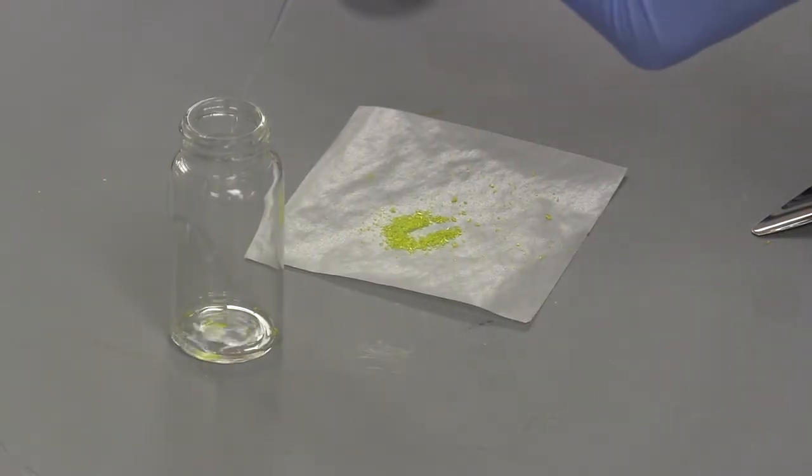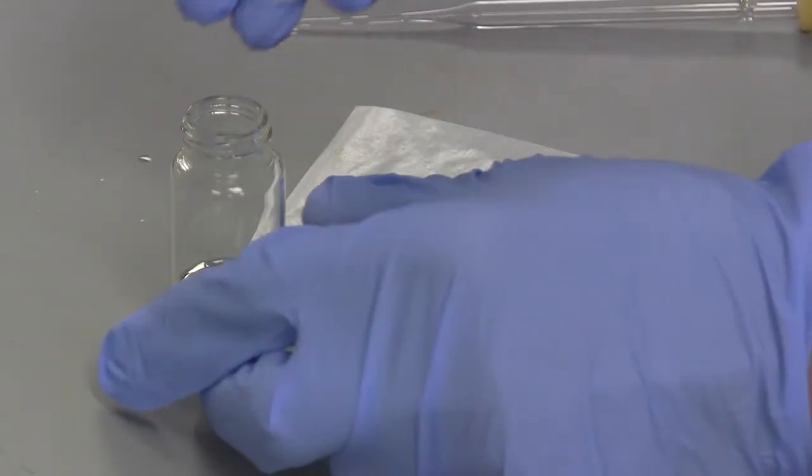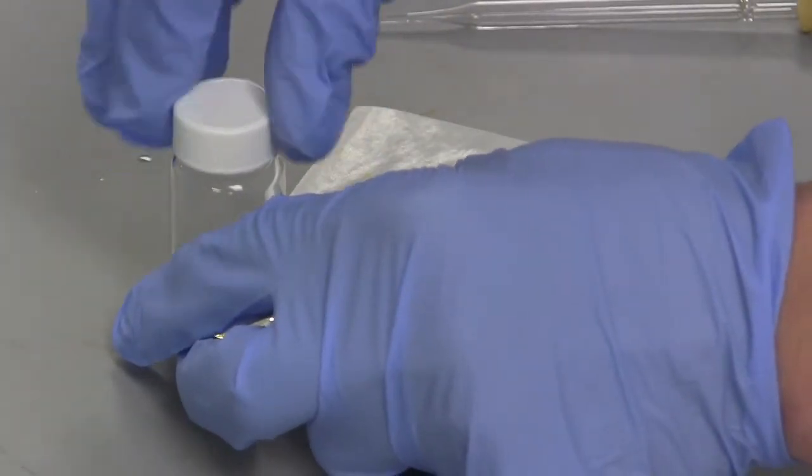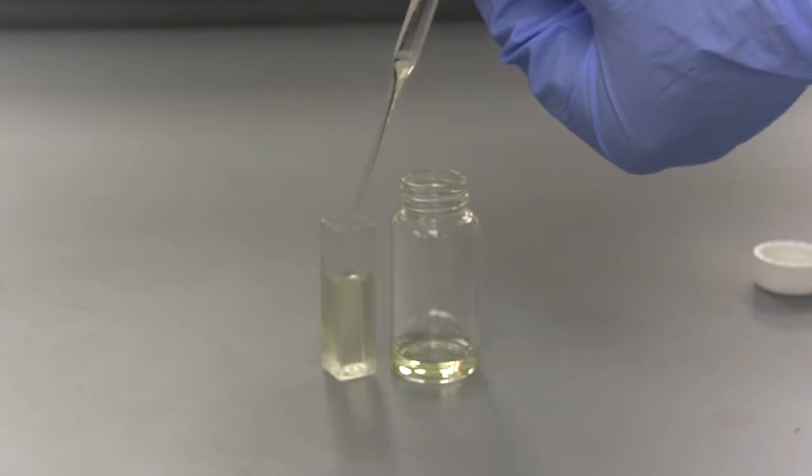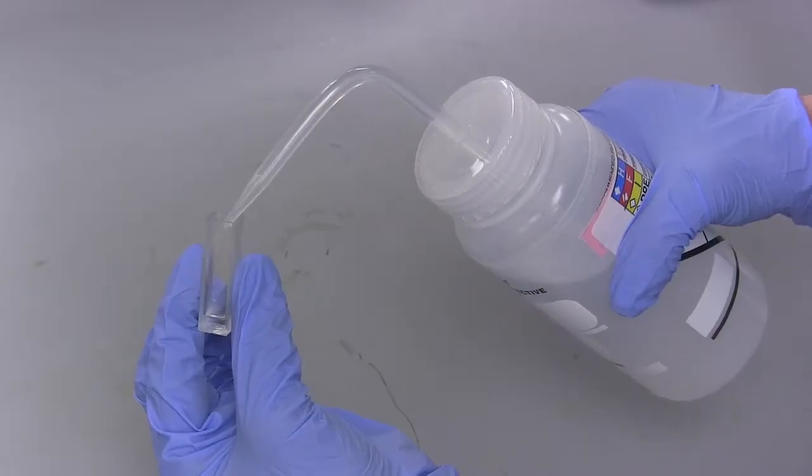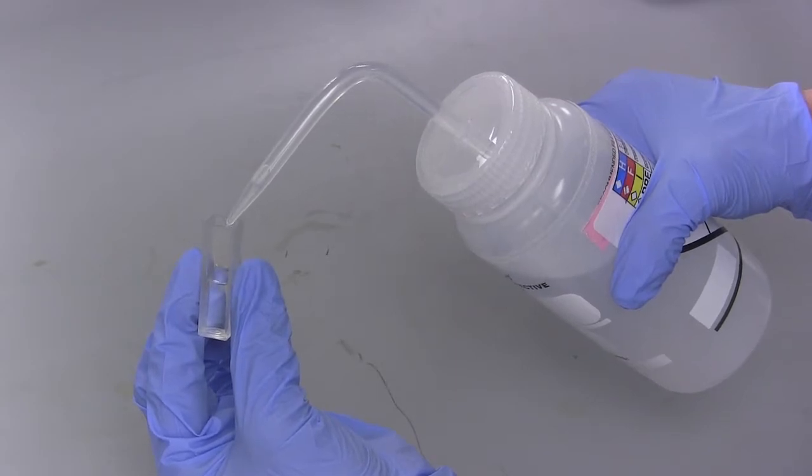Pipette in enough solvent into the scintillation vial to fill it about one quarter full. Cap the scintillation vial and gently swirl it to dissolve the sample. Transfer the solution from the vial to the cuvette, then pipette in the solution to fill the cuvette to the small arrow near the top. Also prepare a blank reference cuvette of solvent for calibration, filled to the arrow at the top.